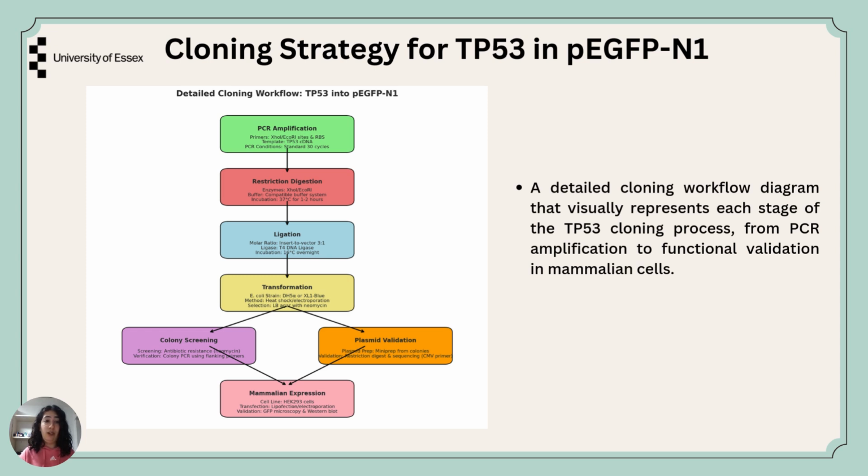Here, in this workflow, which is really complete, you can see the template in the PCR amplification, the buffer in the restriction digestion, and the ligase in the ligation, and everything here is really obvious.